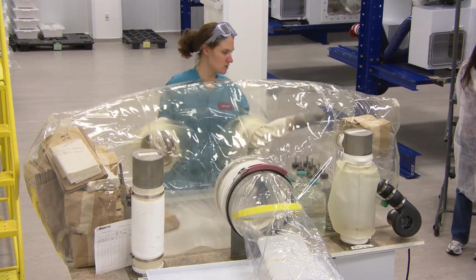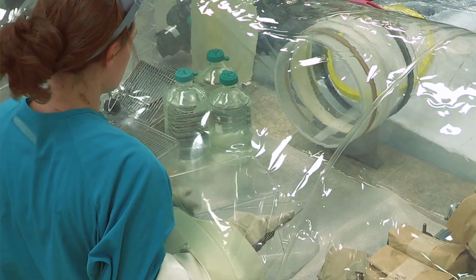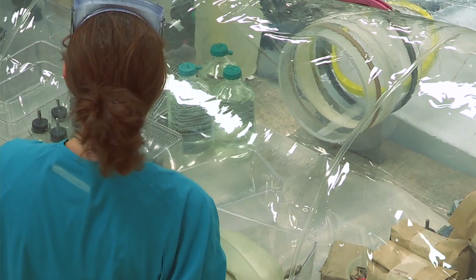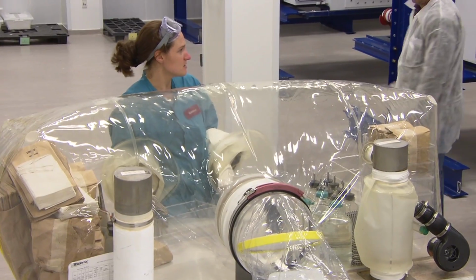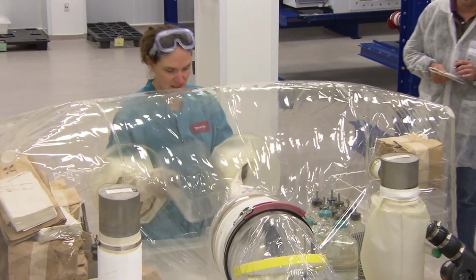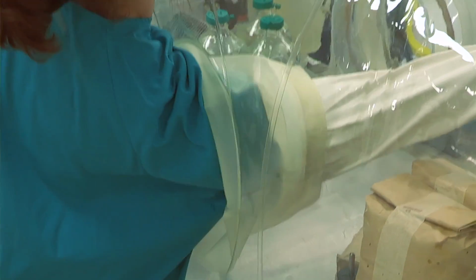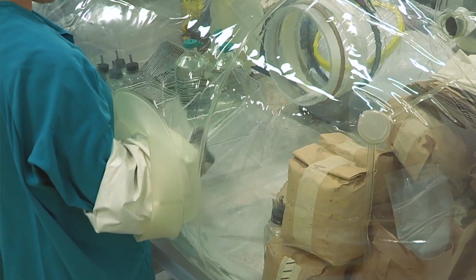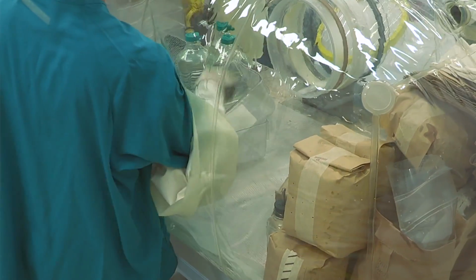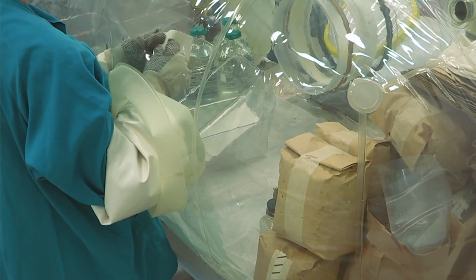Another thing I'd like to show you is our mold trap. The mold traps are typically used when the isolator is going through its series of testing prior to animals being entered. But this is something that you could also use once you have entered animals to make sure that there's no mold within the isolator. Usually we take our 2 cages and put a paper towel along the bottom so the feed doesn't get dried up a little bit in areas and stick to the cages.